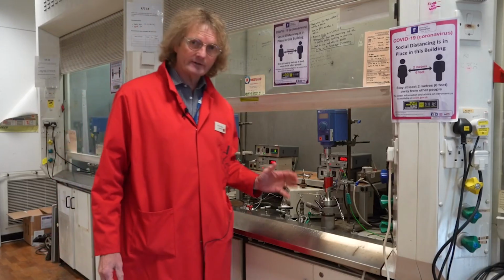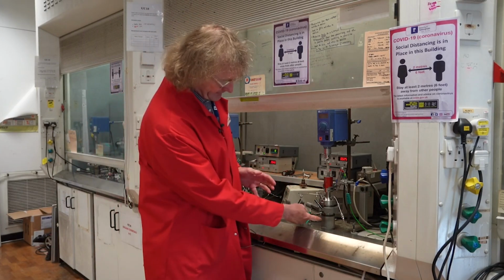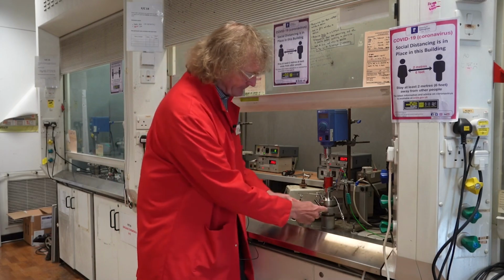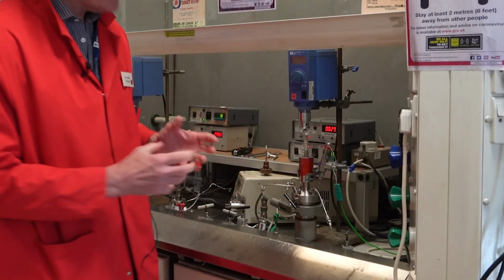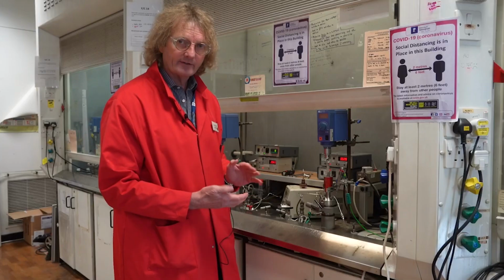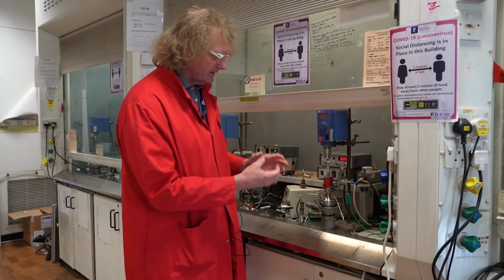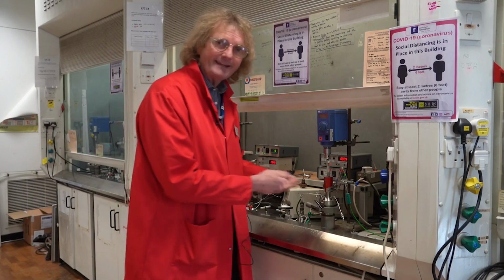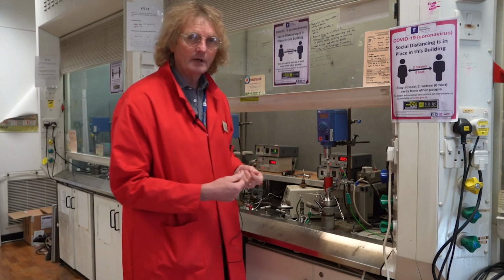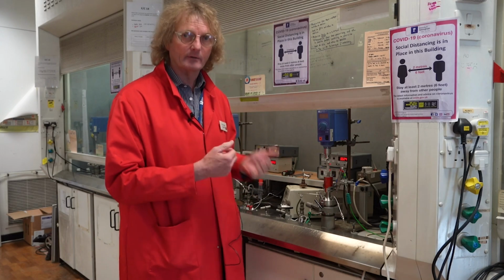Okay, so now you can see one of our autoclaves in place. So there's the 60 ml vessel that I was just showing you. Here you can see the clamp, and what we've now done is we've clamped on the top part of the unit around a seal, and that's given us a high pressure seal. And this mechanism allows us to very easily take it off and put it back on and clean it up reproducibly so that it doesn't leak between experiments.